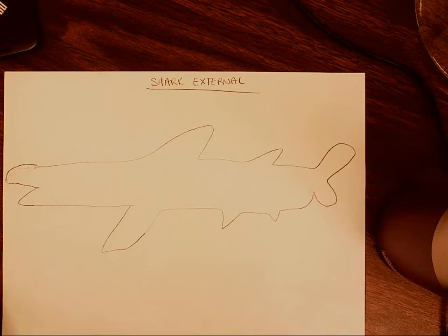Hi guys, today we're going to take a look at our shark's external and internal anatomy to get us ready for our shark dissection that we're going to be doing.